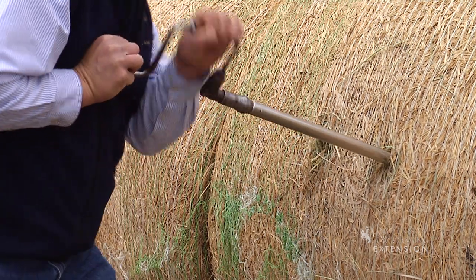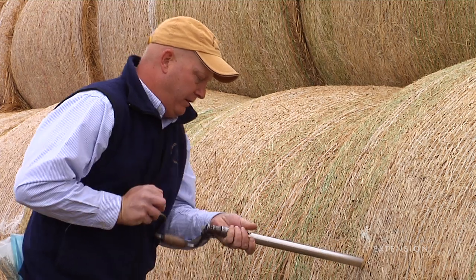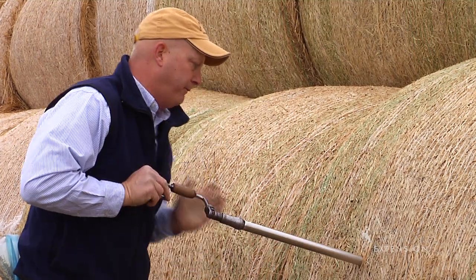In this case we'll aim towards the center of the bale, we'll twist the drill and work in towards the middle of the bale, and we'll get a sample from inside the bale.